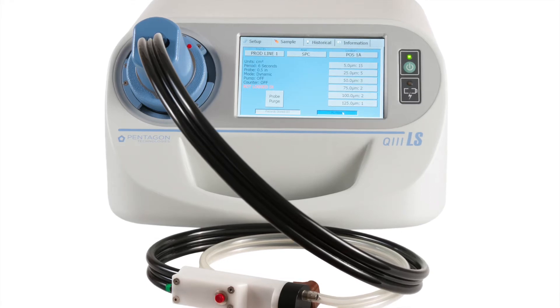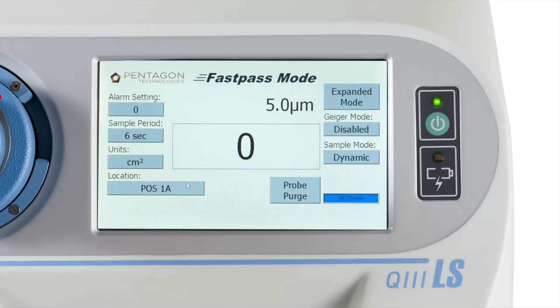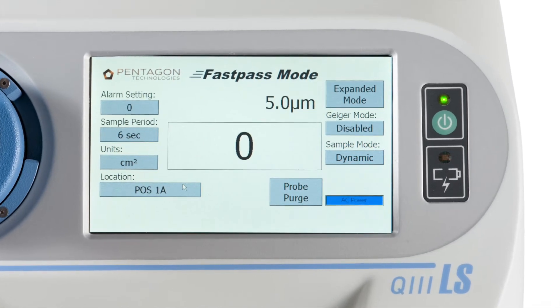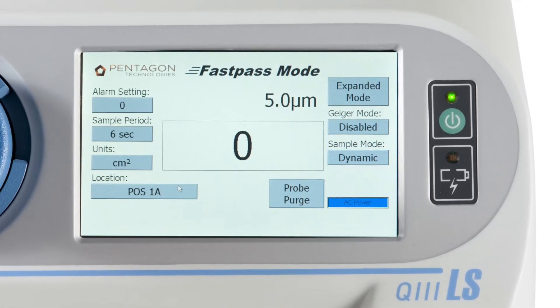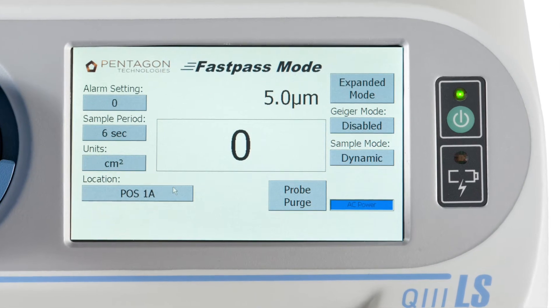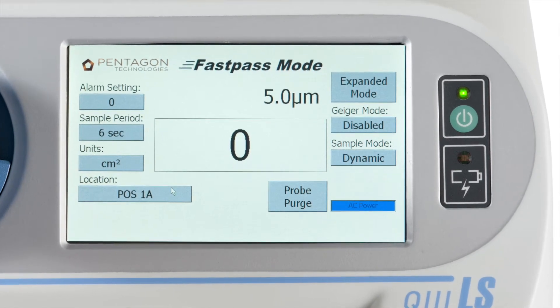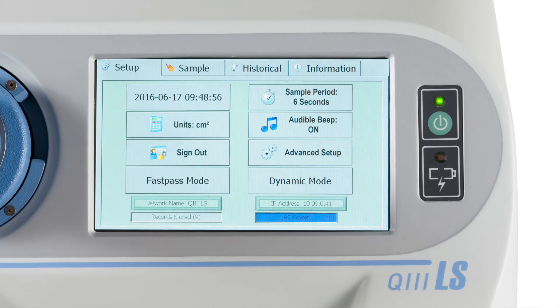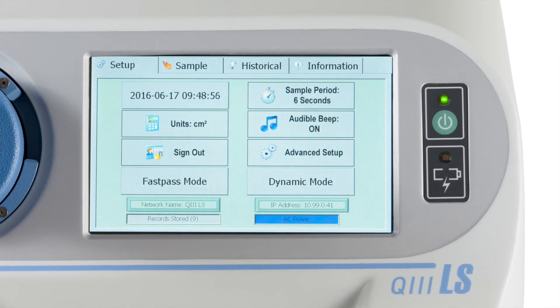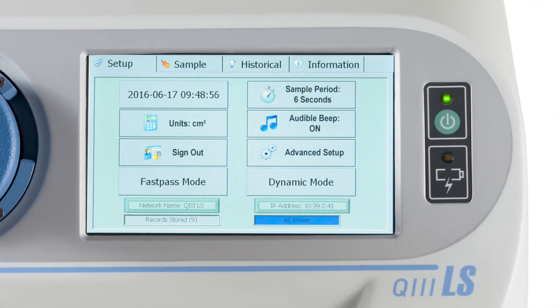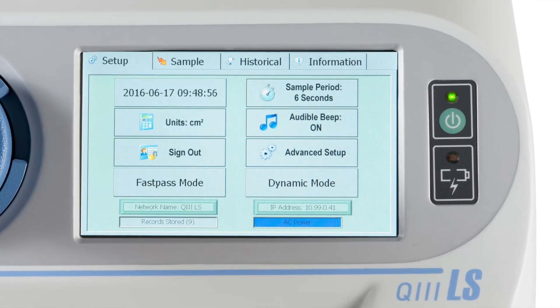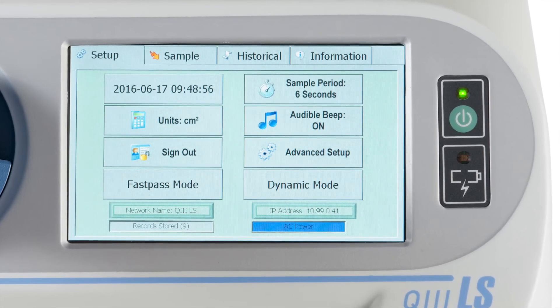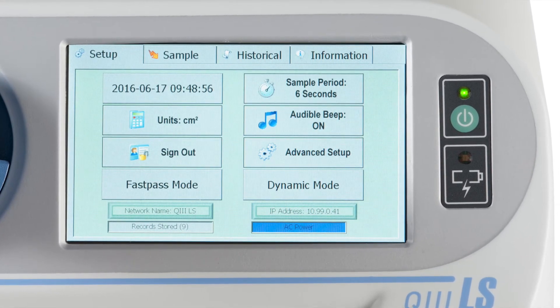After you plug in the Q3LS, it will come up in FastPass mode. To measure particles in all 6 bins, touch the Expanded Mode button and sign in. The default password for owner is O. You can also adjust settings on this page. Make sure your settings are correct each time you make a measurement so you get consistent results.